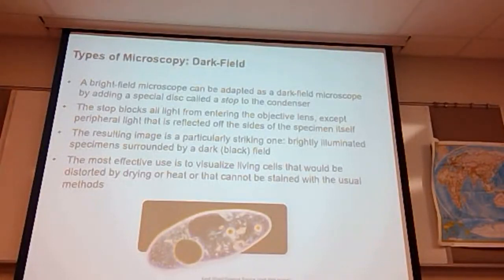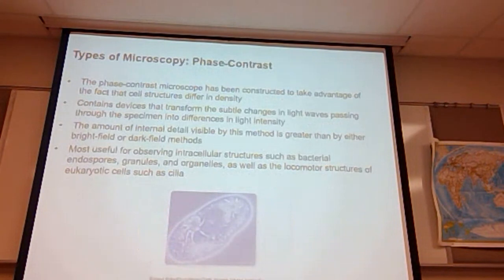For those of you who are in the lab class, because I'm going to load this for both lab and lectures, I'm almost positive there is a question, you know, which one of these types of microscopy is best used for viewing living cells? Dark field microscopy.